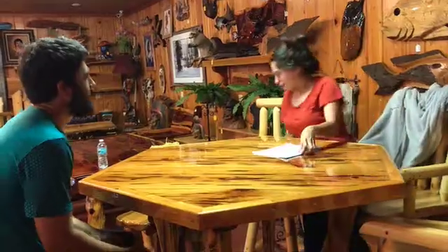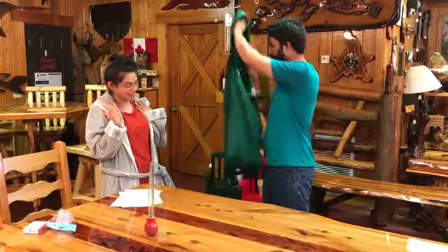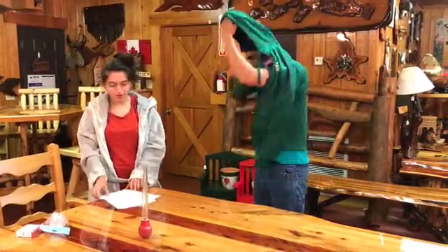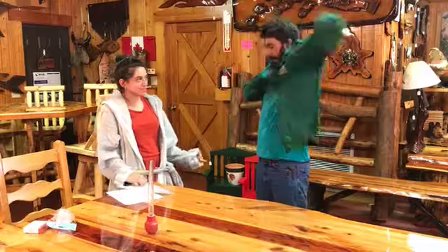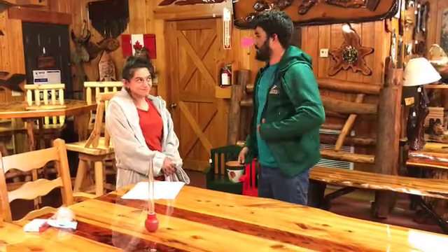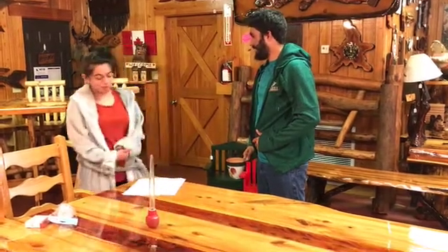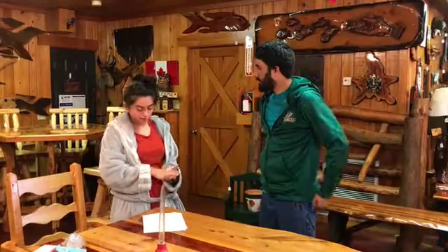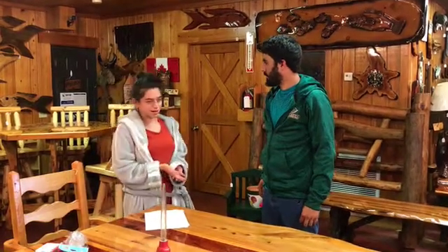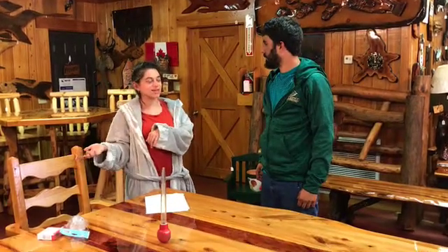Let's go ahead and head to the lab. Put on your lab coat first. See, I have mine. So, can you tell me what you know about the Bradford Assay? There's stuff in it, and when you put more stuff in it, it turns blue, right? Okay. Well, that's better than nothing. So the stuff that you mentioned is protein, and the Bradford Assay is used to measure the concentration of protein.